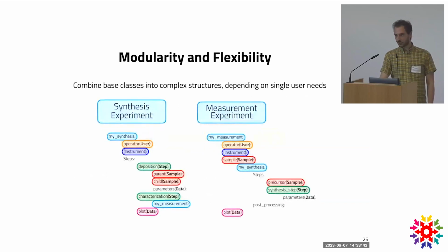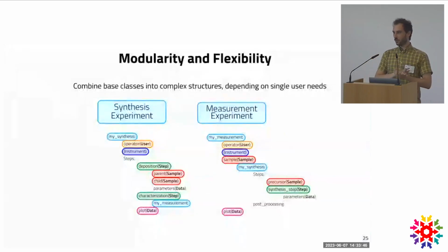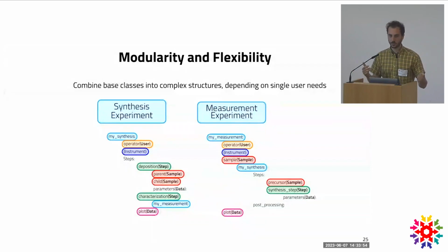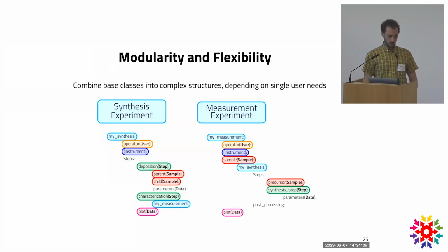The base section approach also allows us to develop little building blocks of our data set that we can use to compose our own full description of our experiment. This is the modularity approach that fosters the flexibility that is fundamental, as we saw in this last year and a half in which we have been doing this work.